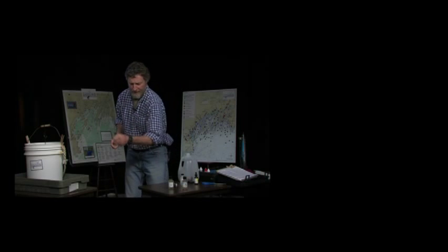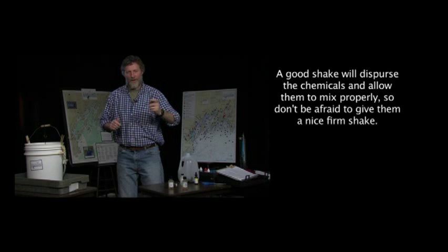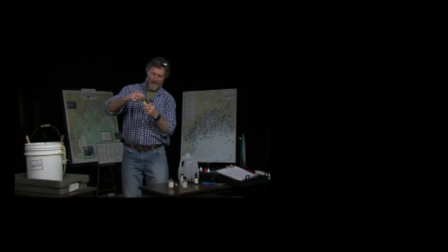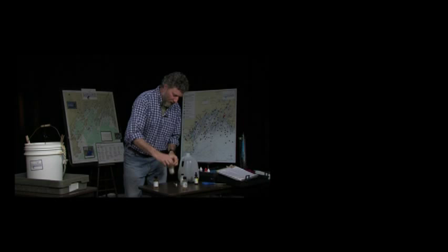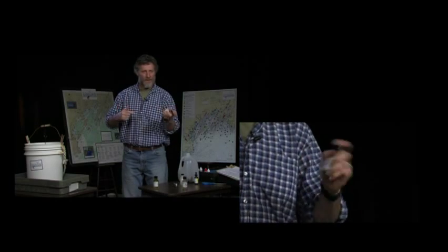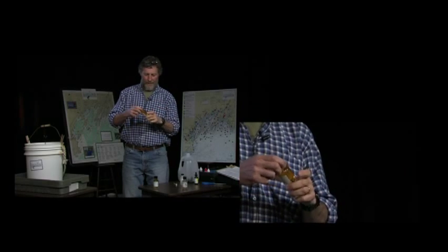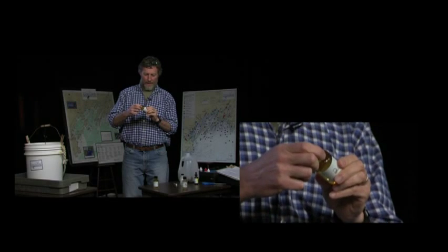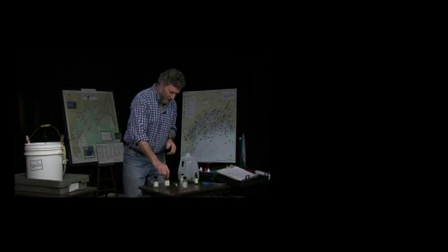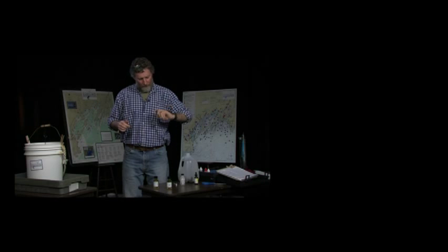So we'll take each of these and give them a good vigorous shake. You want to really kind of work your wrists when you do this because you want to make sure that it's well mixed. Sometimes you'll see what's known as like a pepper flake look to it. And often that means you just haven't shaken it up well enough and let the sulfuric acid work with all the chemicals. Sometimes there have been occasions where there have been contaminants that get into the sample that do mess up your end results. Typically you can see them in the water. Again, here's this white precipitate that's getting eaten up. So we'll give all 3 of those a really good shake.